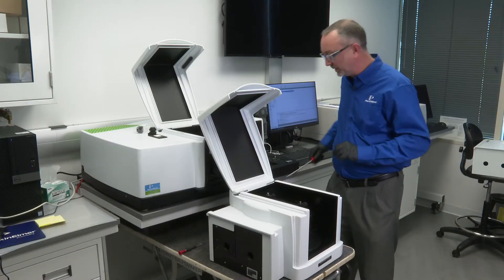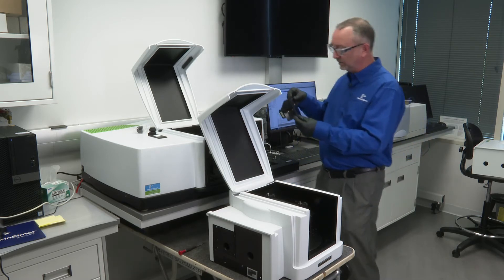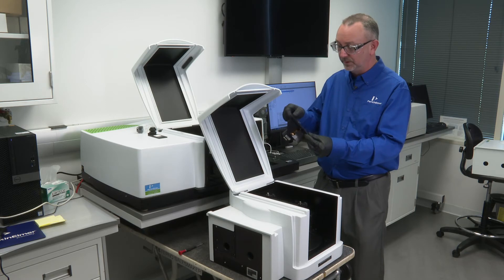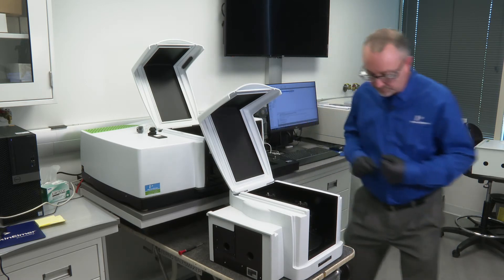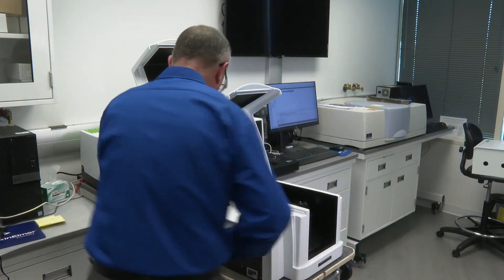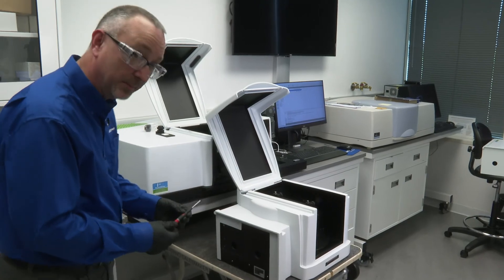One detector down, one to go. The reference detector looks like this. This contains five screws, sometimes four. This is a screwdriver that comes with the TAMS kit.